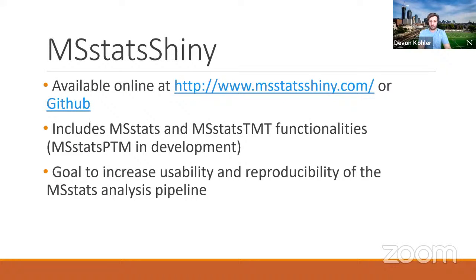Okay, so those are the main MSstats packages. There's also MSstatsLOBD. I didn't go over it here. Like I said, it's not really integrated in the main workflow, but it's available on Bioconductor if you'd like to use it.